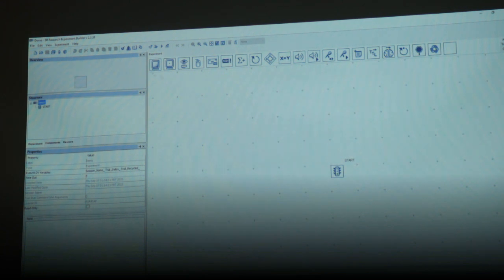This type of view helps people who like to see more verbal sort of instructions. This is my interpretation of why they are here: for different kinds of people who design, a different kind of tool will help them track their thought on where the experiment is going, what is lacking, what is missing, and how they are fitting into each other. So this view helps those kind of people better.